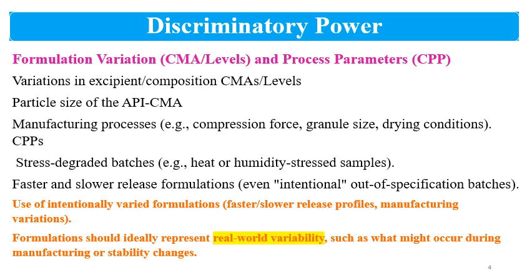Mainly, discriminatory power is required to be shown for all the modified release types of formulations, and the immediate release formulations which are containing insoluble APIs. Sometimes it becomes difficult to demonstrate the discriminatory ability of the method when the formulation contains a BCS class 1 or 3 API and when the drug product shows rapid or very rapid drug release or dissolution.